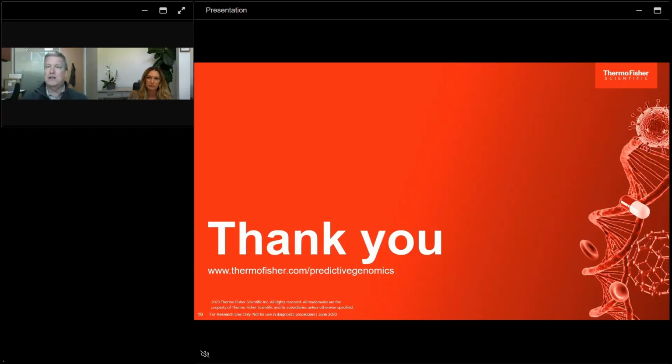Another one is Korea. They're very interested in identifying the allelic frequencies in some of their populations as well. So yes, there are a lot of other organizations, a lot of other populations that are using the Thermo Fisher model to understand the genetics of their populations.